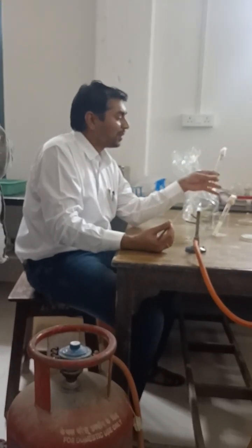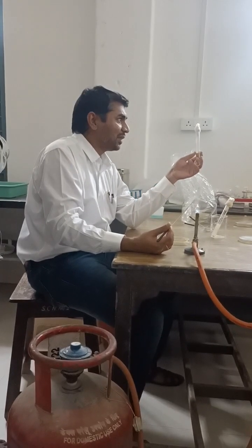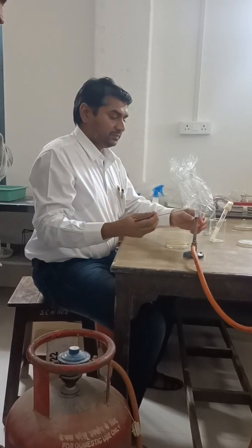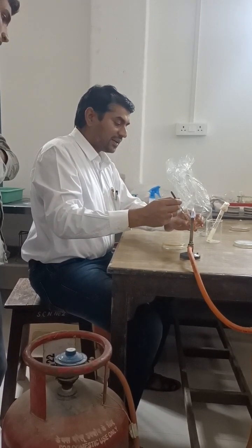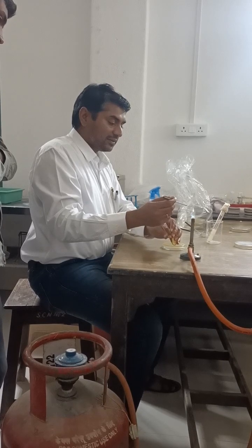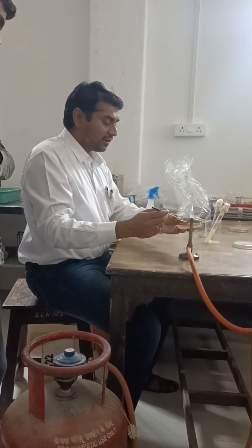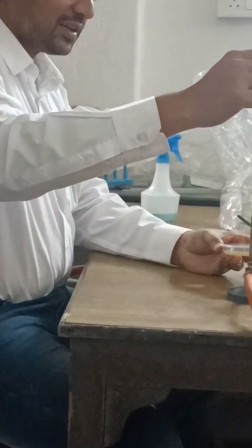This video focuses on how the spread plate method is performed. First, flame the mouth of the test tube, then transfer a loop full of sample. Flame the mouth of the test tube again and replace the cap. Then transfer the sample aseptically at the center of the solidified medium present in the petri plate.